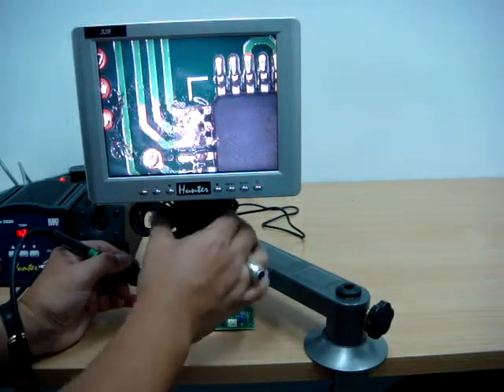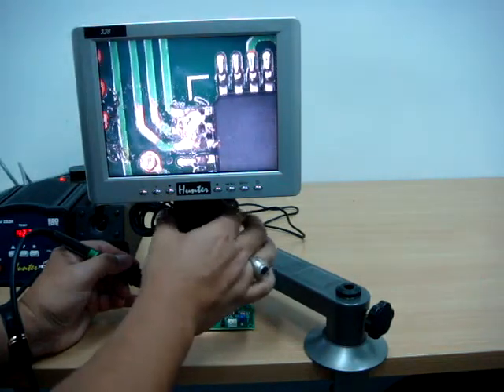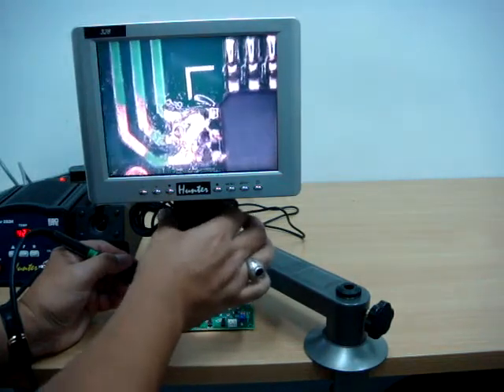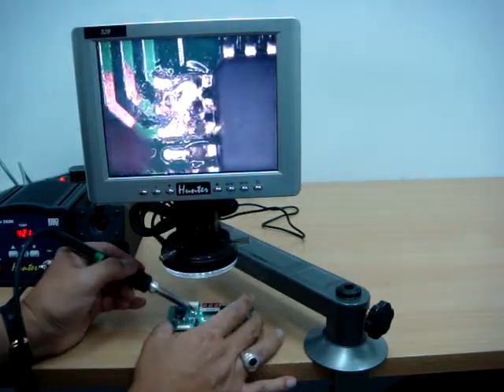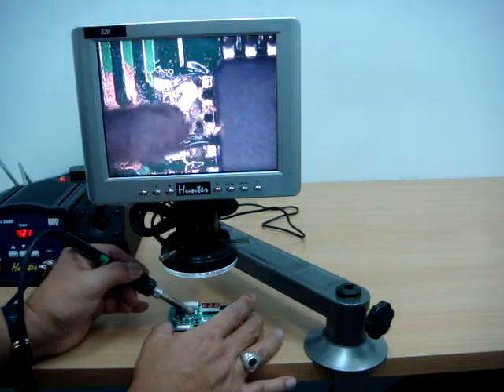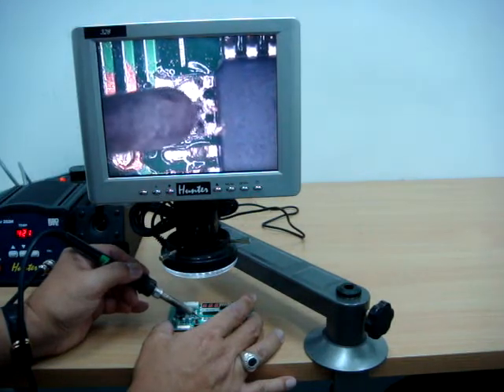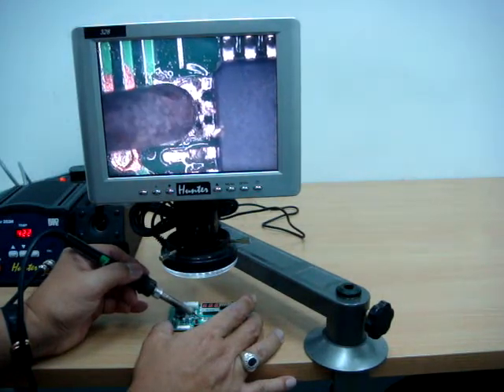When the operator can increase the size, you see much more clearly on those very fine areas.